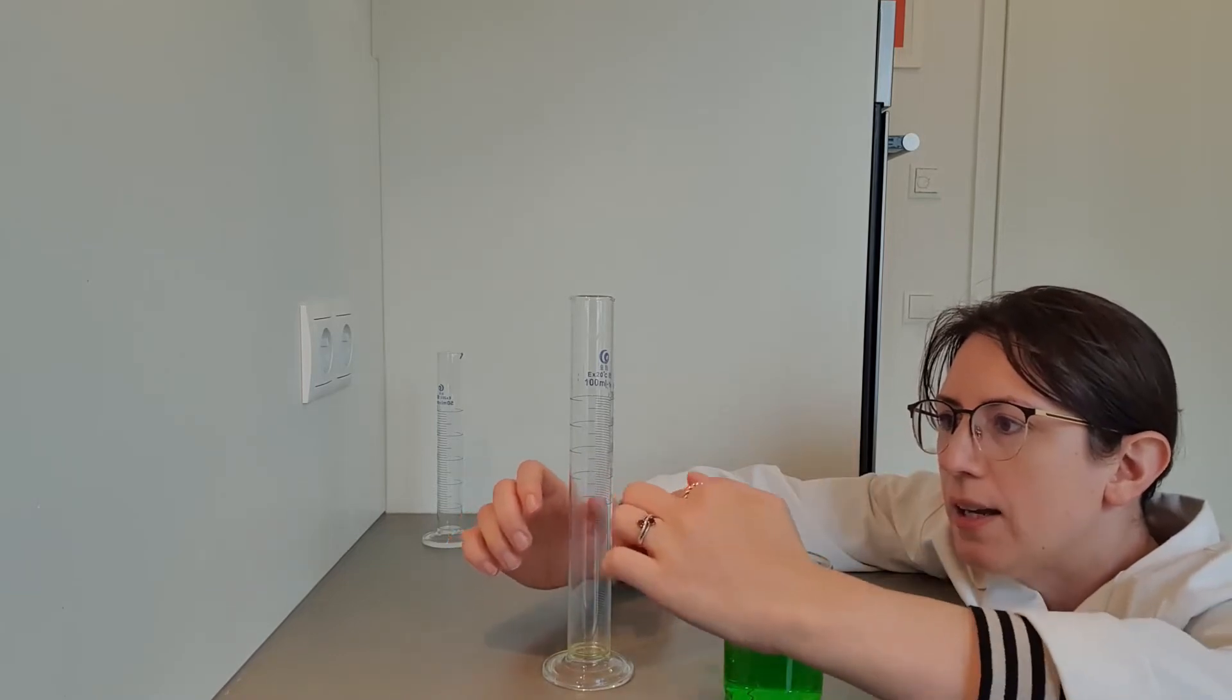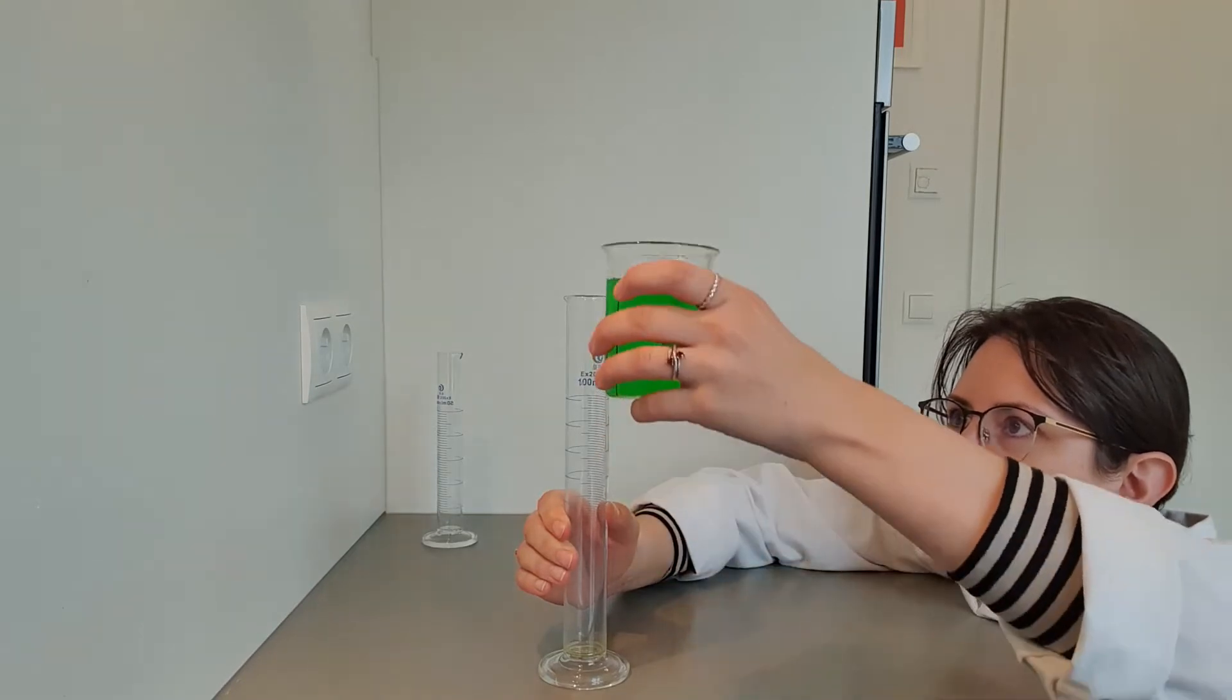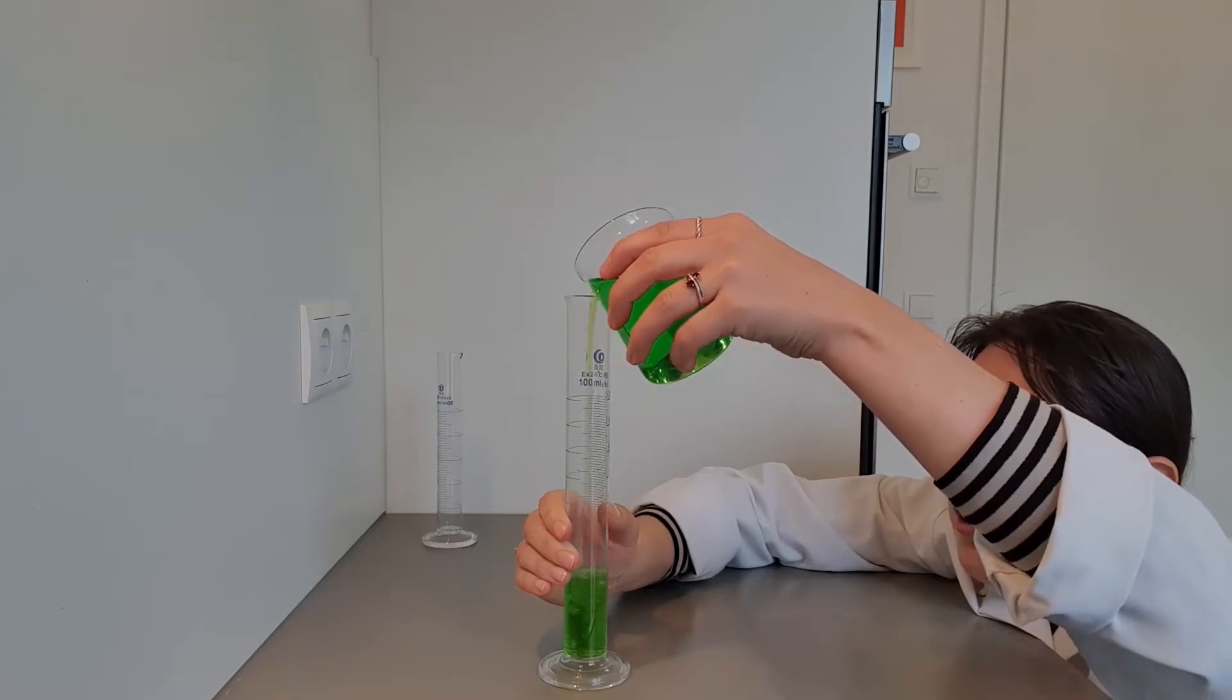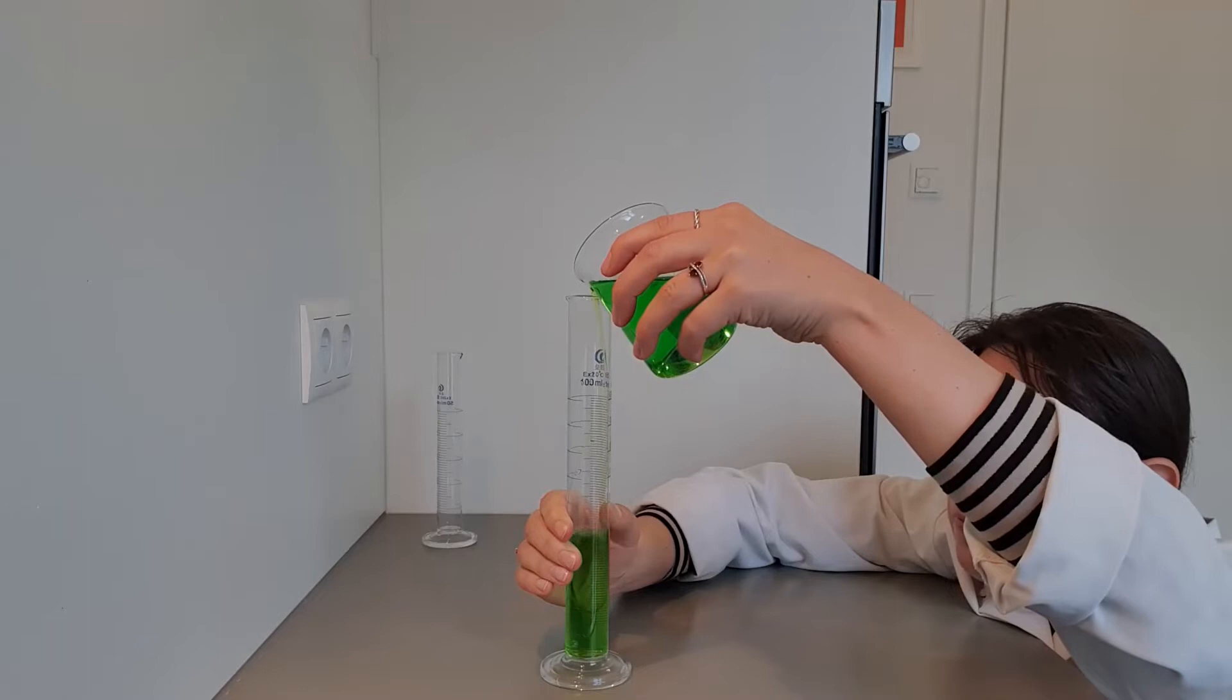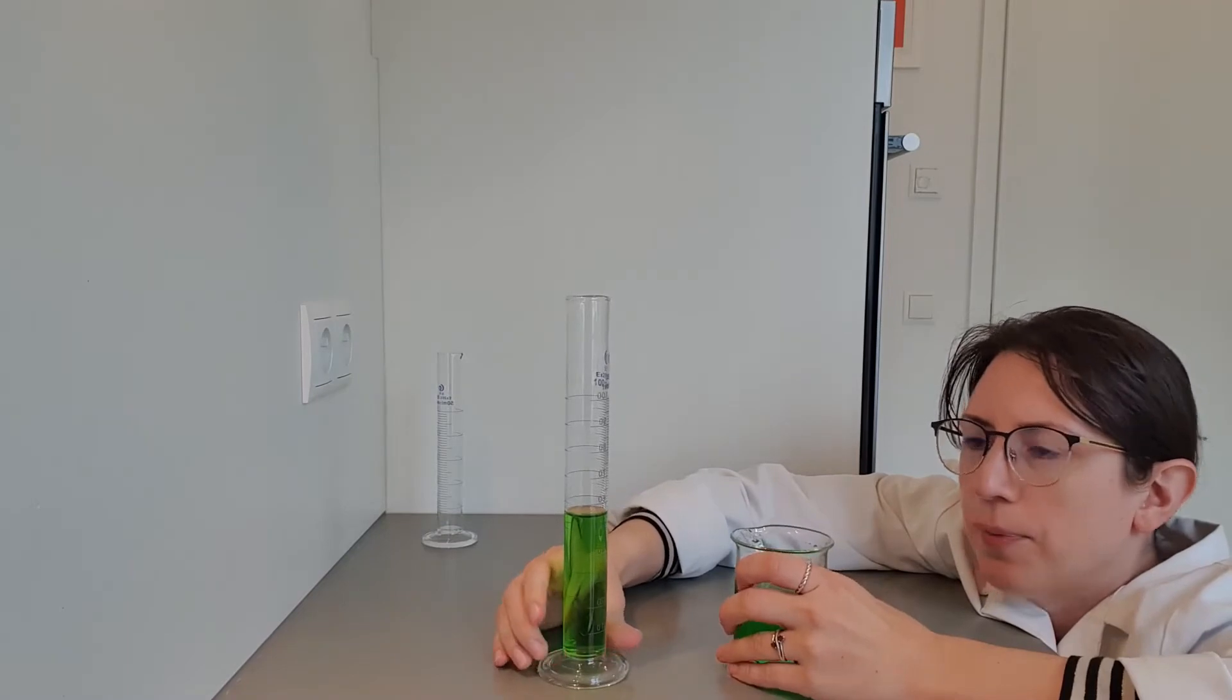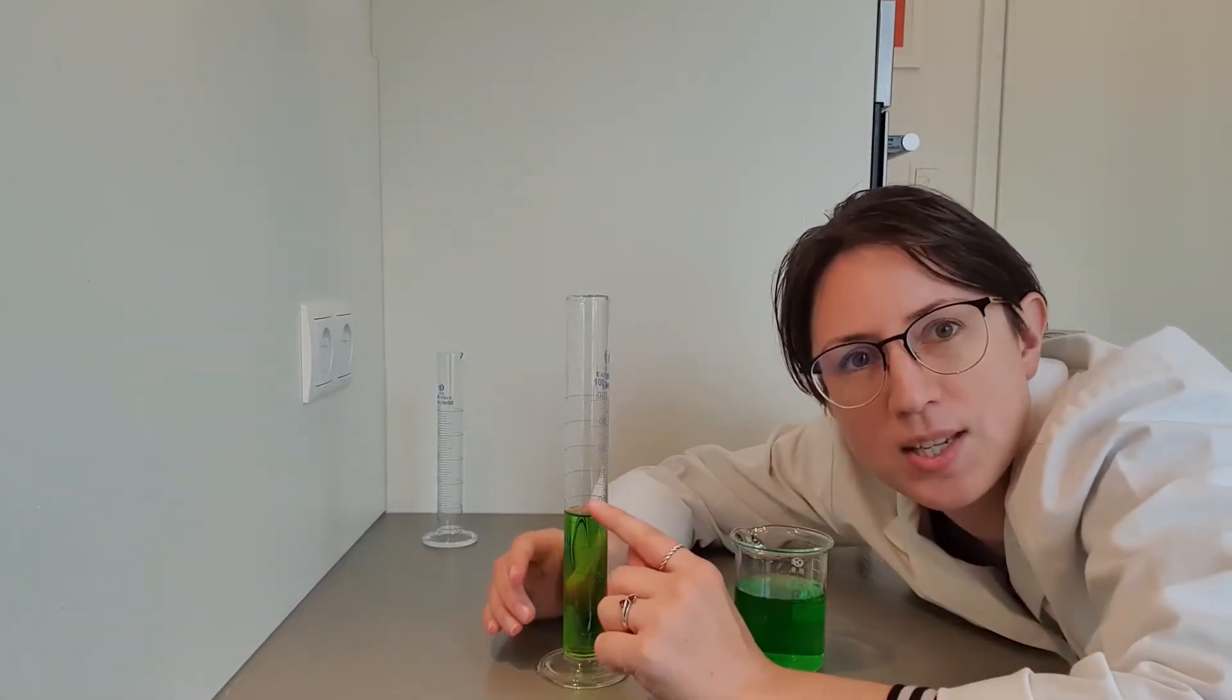So now I'm going to pour... gorgeous green! Now, as I approach 60, I'm going to slow down because what I want is the meniscus line to sit straight on the 60 line.